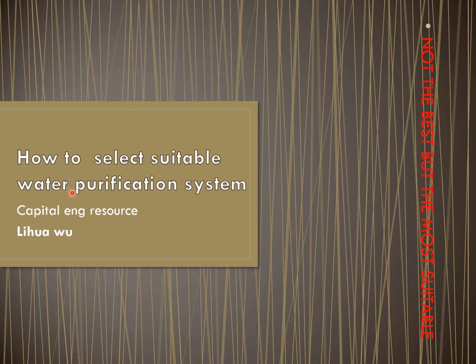Today we will introduce how to select the suitable water purification system for your lab. We will follow strictly a principle: not the best, but the most suitable. We will always follow this principle.